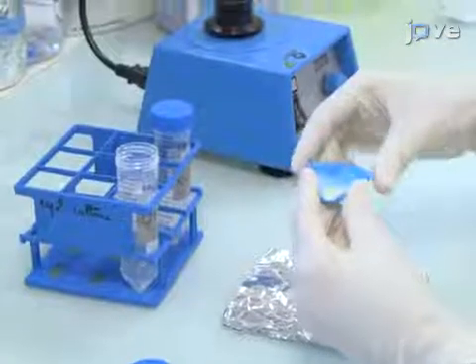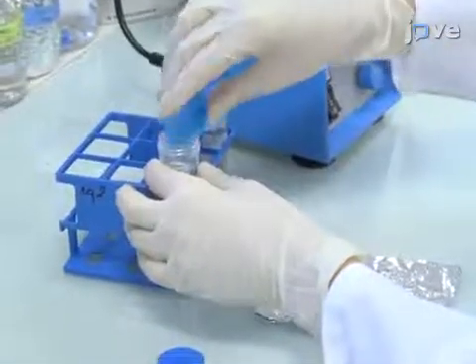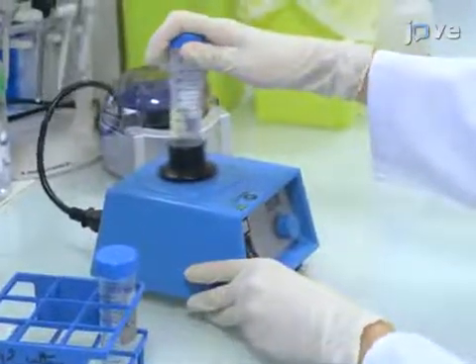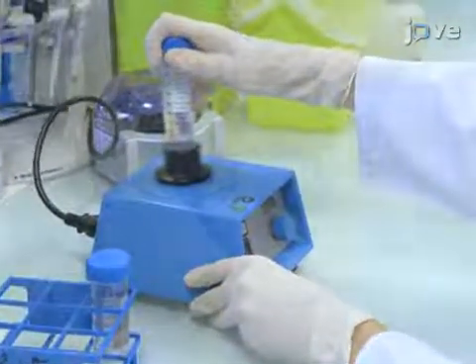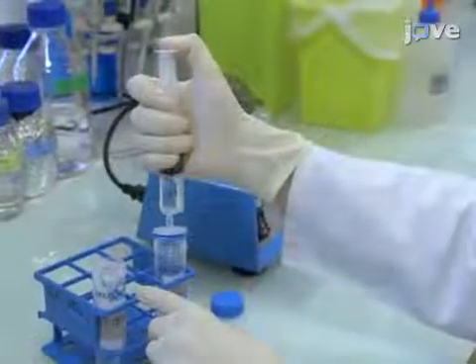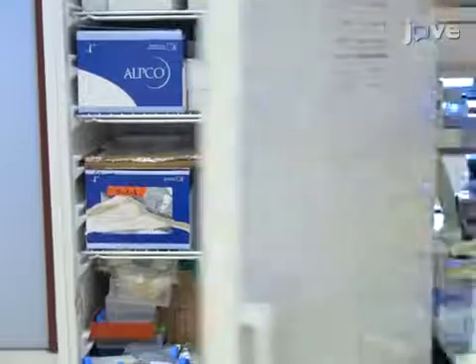To prepare X-Dulbecco's phosphate buffered saline, or XDPBS, make a solution of DPBS containing 0.2% weight per volume bovine serum albumin. Filter the solution through a 0.2 micrometer filter, then store the XDPBS at 4 degrees Celsius.